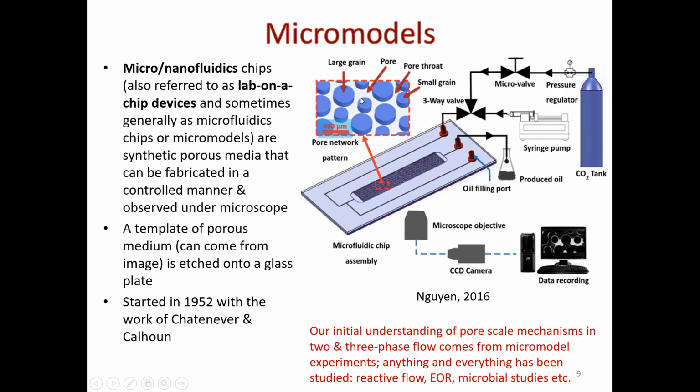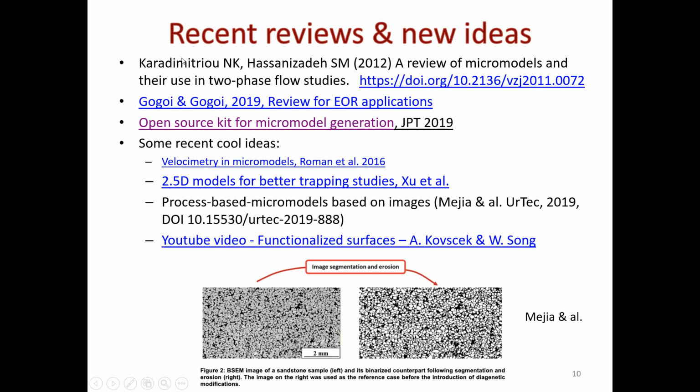Basically, you could have a depth of 20 micron here, and in the middle here 50 micron, right? And that would create this 2.5D model. That's basically what Dr. Bauhoff's group here has.